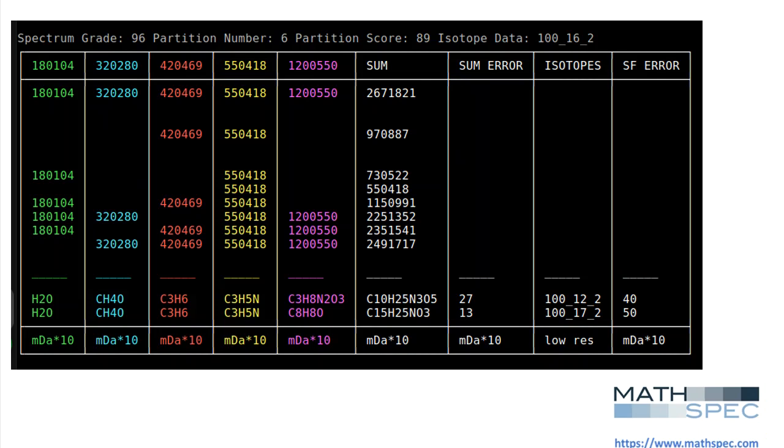Color can make the results easier to understand and report. If we were to hypothesize that this analyte is PubChem CID 4171 based on the second formula, we could then draw CID 4171 metoprolol in a similar color scheme for easy comparison. This clear correlation is fairly convincing that this compound might be the analyte that produced the mass spectral data. Note that unfortunately our transform software does not draw the color-coded structures.